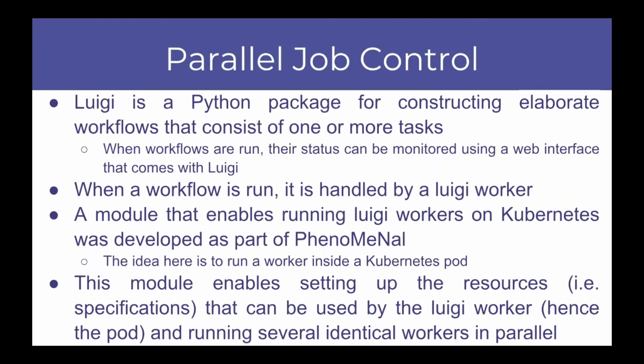That interface allows you to run Luigi workers inside Kubernetes pods, and that's exactly what we're going to use. This module enables us to set up the resources using specifications that can be used by the Luigi worker, i.e. by the Kubernetes pod, and then we can run several identical workers in parallel.